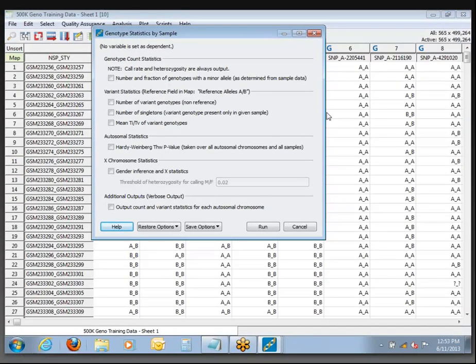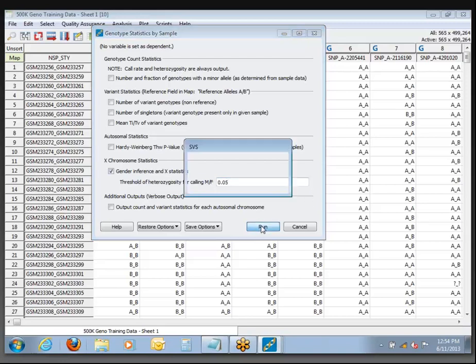What we want to do right now is just go ahead and run this. Let's turn on gender inference and X statistics, and I'm going to increase this threshold for male-female separation up to 5%. By default, you see it always will generate call rates and heterozygosity, and that heterozygosity will be split out by both autosomal and overall heterozygosity. Go ahead and run this — it should go relatively quickly.